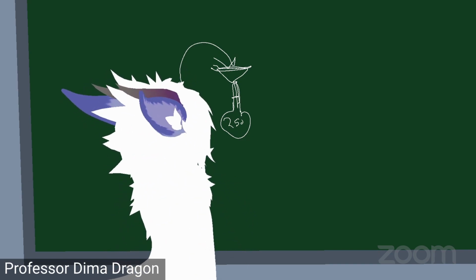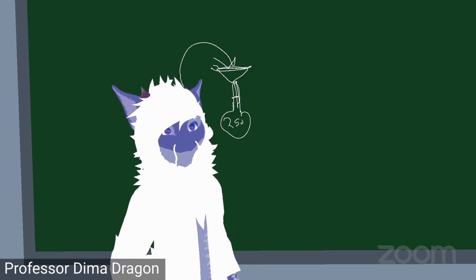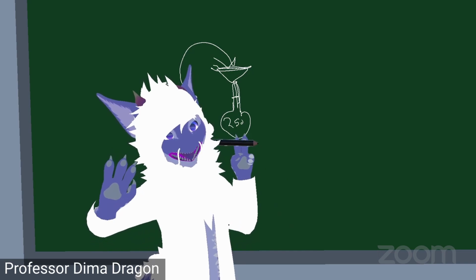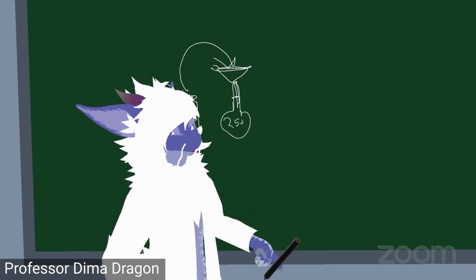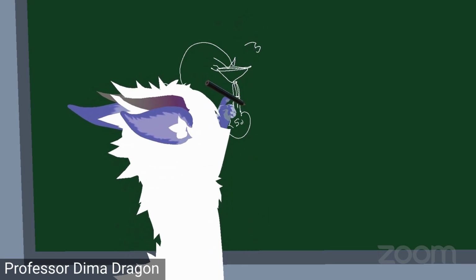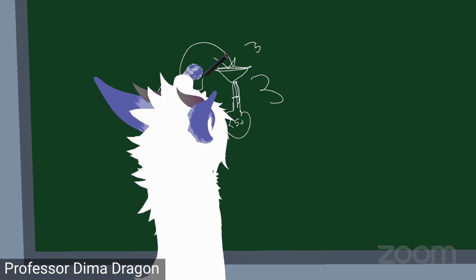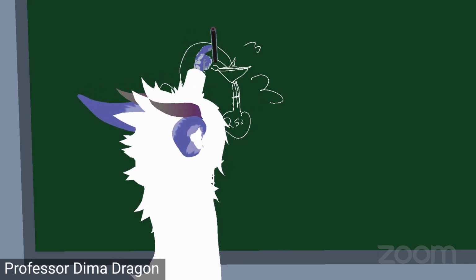So make sure you have the filter here. Make sure not to get aminos in here. If you do, it's not a huge deal, but again, we're going to try not to. And you're going to rinse it down at least 3 times. At least 3 times, okay? With your squirt bottle, just go around it once.